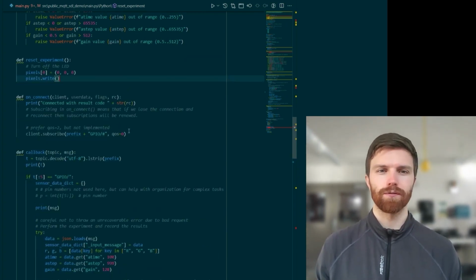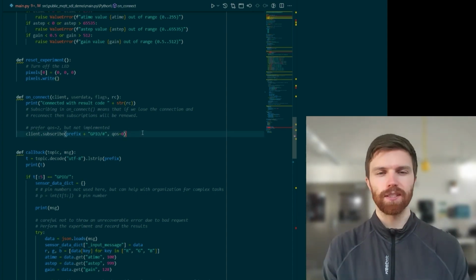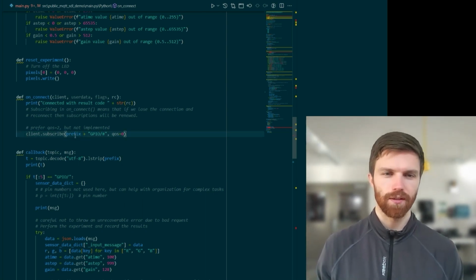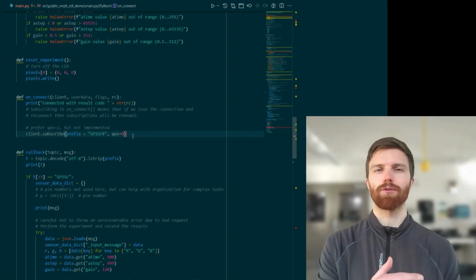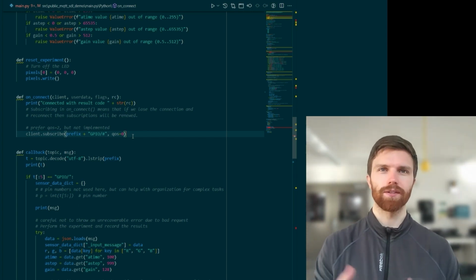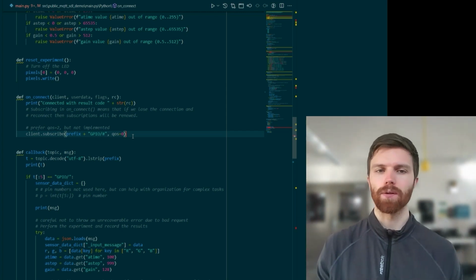And we have a function for what happens when subscriptions to the MQTT get renewed, which is just subscribing to the topic that we had before and saying that this is on, adding this GPIO part of the string there. And QoS is kind of a nuanced topic, but essentially, the different levels of this quality of service determine how robust the communication between a client and a device are.